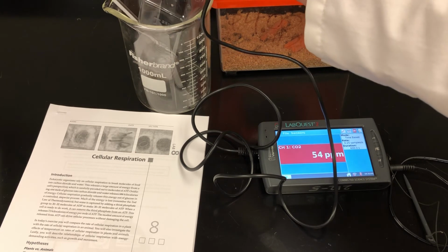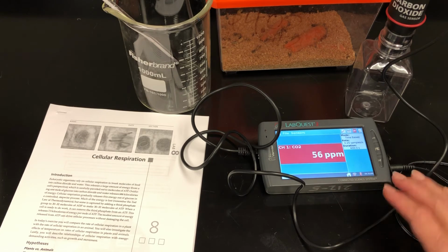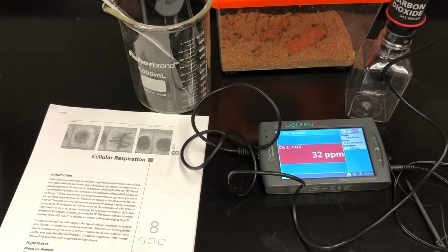That way we can see, well, this is the CO2 that was produced at the normal temperature. What's the CO2 production rate at cold temperatures, and how does that affect the metabolic rate of both the bean sprouts and the super worms? I'm going to explain a little bit more on the data tables in another video, but this is the basic equipment that we're going to be using, and I'm going to have to run this experiment basically 4 times.